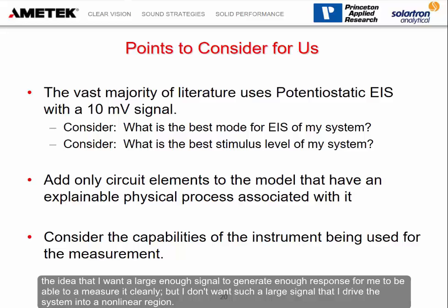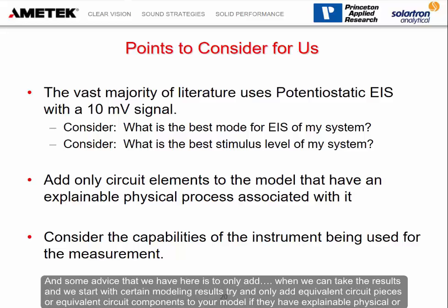And some advice that we have here is, when we take the results and start modeling them, try to only add equivalent circuit components to your model if they have explainable physical or chemical processes in your cell.